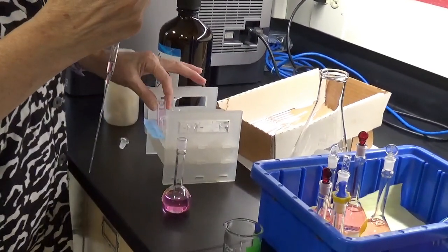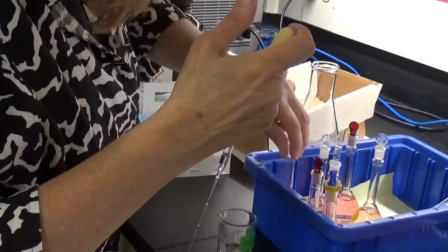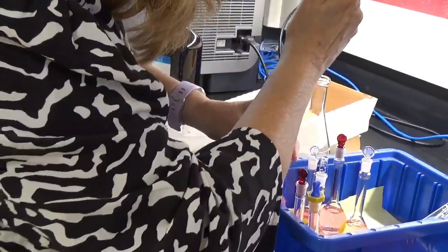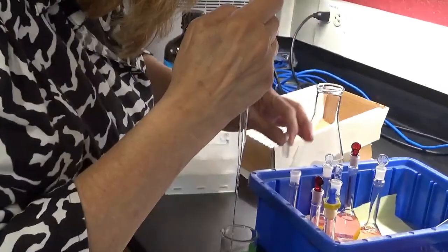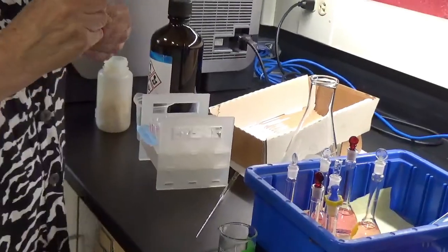All right, that's one. I'm not going to show you all of these. I'll show you the first couple, and it's pretty self-explanatory after that. I want to get rid of the solution. Take this off. Clean pipette.